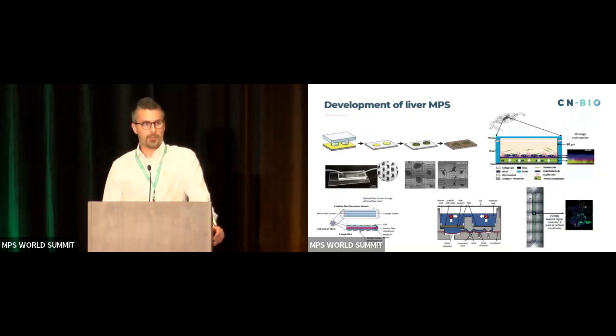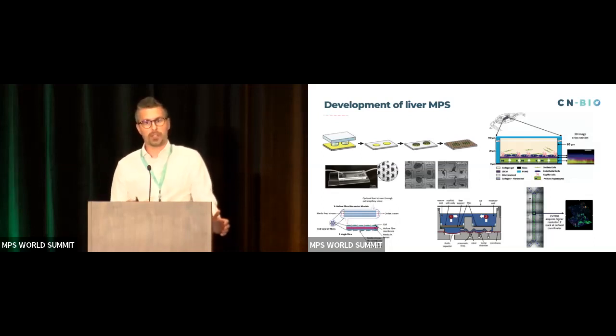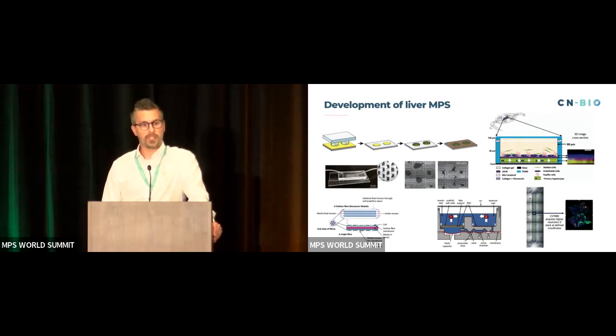And there's been a whole bunch of liver MPS systems built over the years, and probably another will be described at this conference. One of the key challenges still remains, as was talked about in some of the previous conversations: how do we drive the adoption of these technologies? How do we make them being used every day? One of the key activities is to engage with the regulators and to do cross-lab and intra-lab comparisons to show that these are reproducible, robust tools that can be used every day to ask key questions, and to do this in a context-dependent manner.